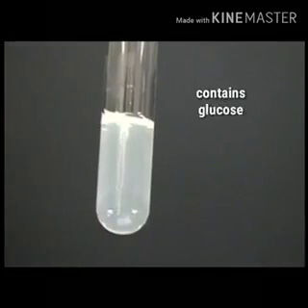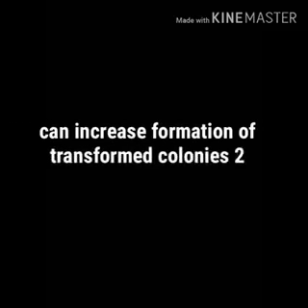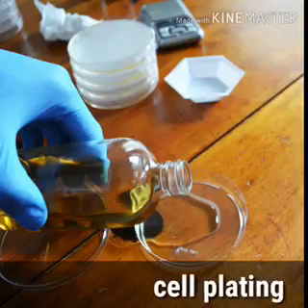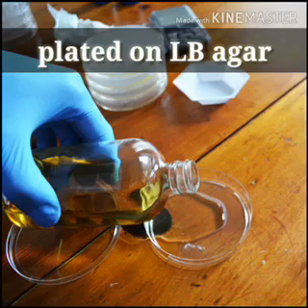SOC medium, which contains glucose and MgCl2, is recommended to maximize transformation efficiency. Use of SOC medium instead of Lennox L broth can increase formation of transformed colonies 2 to 3-fold. The final step is cell plating. After growing in SOC medium, the cells are plated on LB agar with appropriate antibiotics or other agents for identification and recovery of successful transformants.